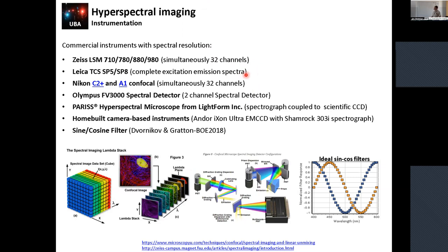The thing is, there are some other solutions for hyperspectral imaging, and one of them is basically the camera. If you have a camera and you project a point onto your camera, well, the spectra in your camera, you can collect the intensity in a space on the chip of your camera, and you can assign, if you calibrate, the wavelength of each of the pixels, and you will have really great resolution, on the nanometer scale.